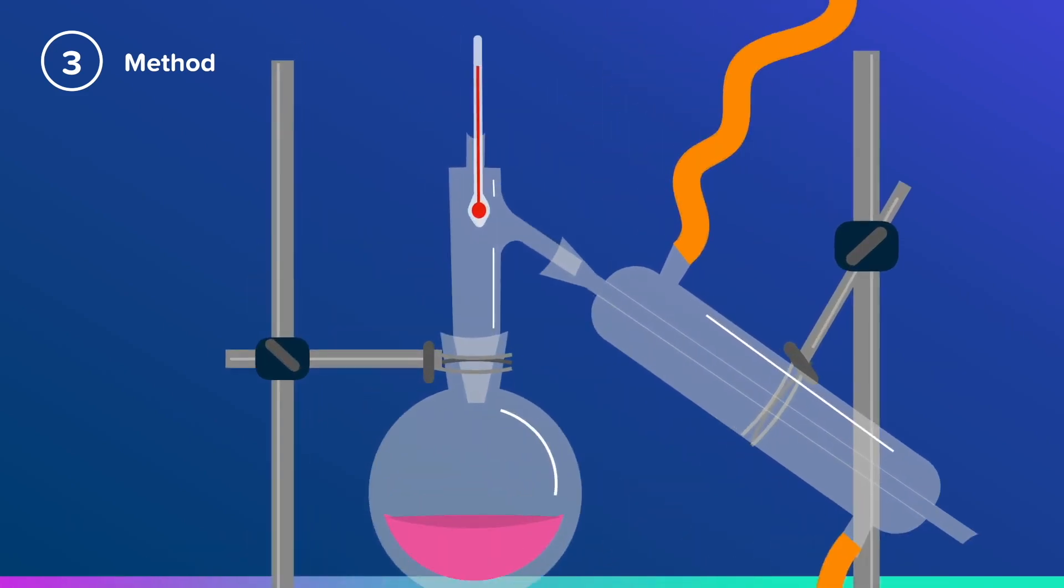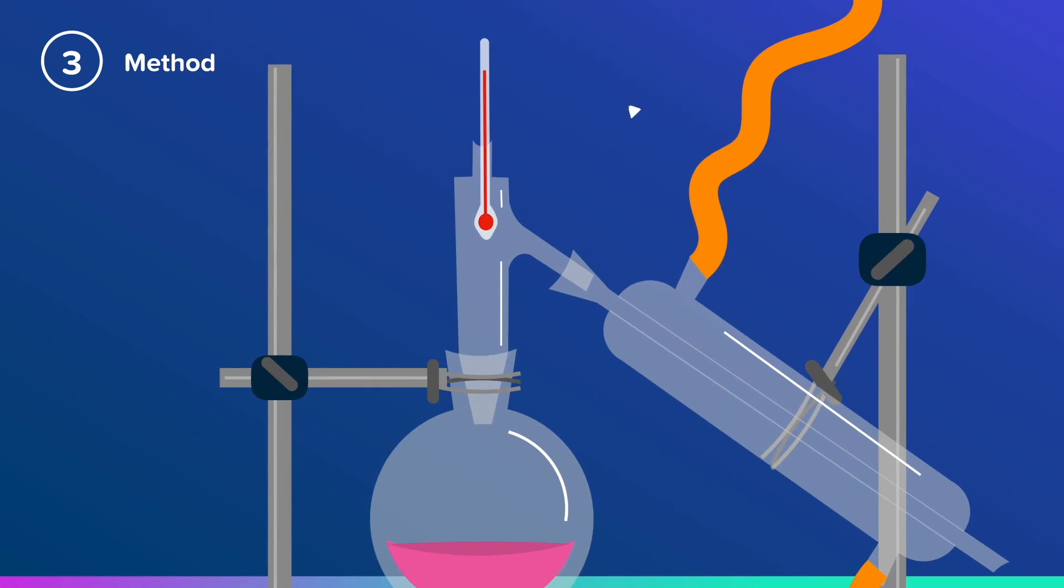Let's look at the thermometer in a little bit more detail. Make sure it's positioned so that it's measuring the temperature of gas that's evaporating out of the round-bottomed flask and then moving into the condenser. This way, you can make sure that it's always at the correct boiling point.